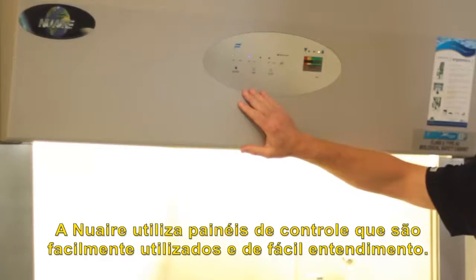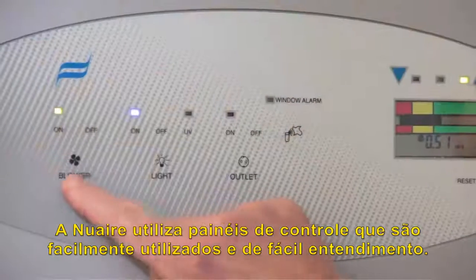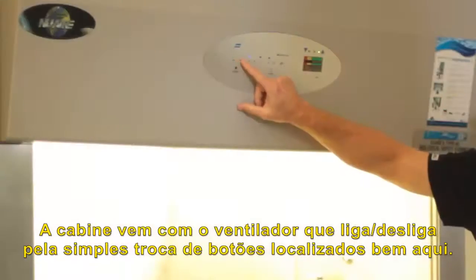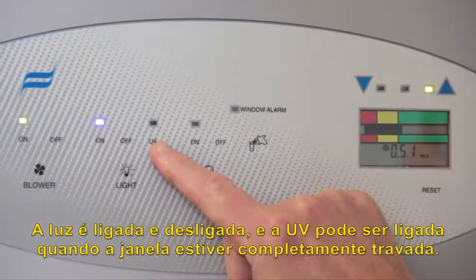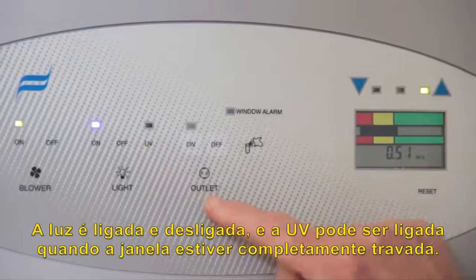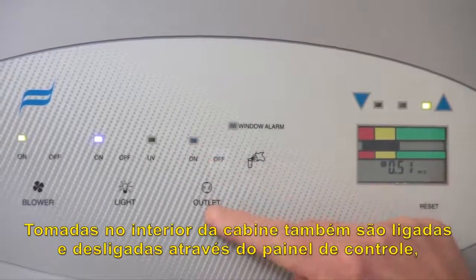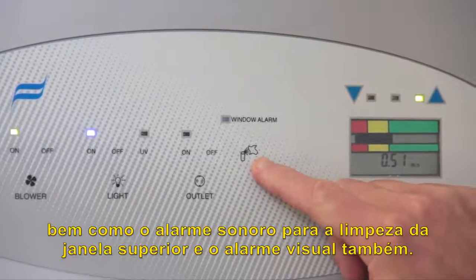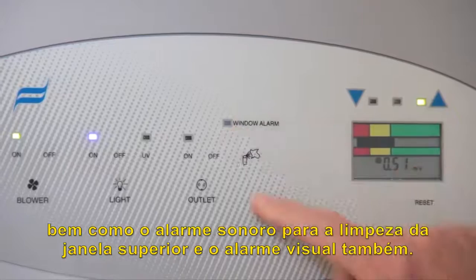The cabinet utilizes control panels that are easy to use and very understandable. The blower turns on and off by simple membrane switch buttons. The light is turned on and off, and UV can be turned on when the window is in the fully closed interlock position. Outlets for the interior of the cabinet are also turned on and off remotely from the control panel, as well as the audible alarm for the high window clean and the visual window alarm.